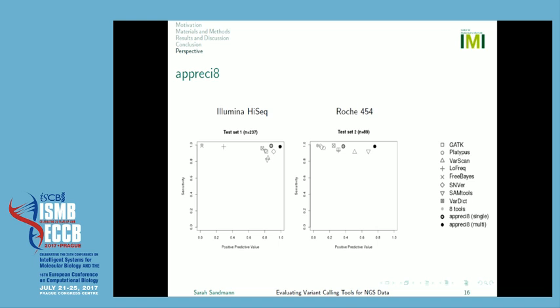So, I can tell you right now, we have analyzed more data. We had Illumina HiSeq, MiSeq, and NextSeq data, even Ion Torrent data. We considered different disease entities, so not all MDS. We had considerably larger and different target regions, and still it worked really well.